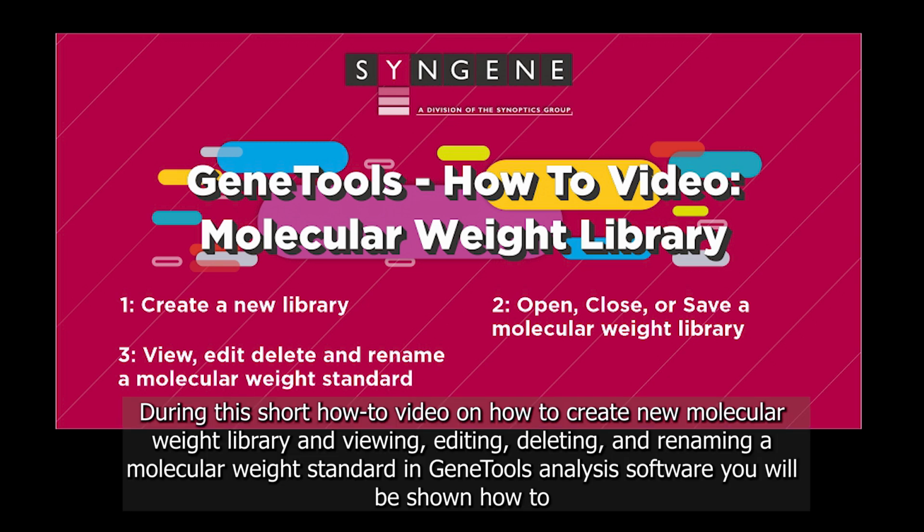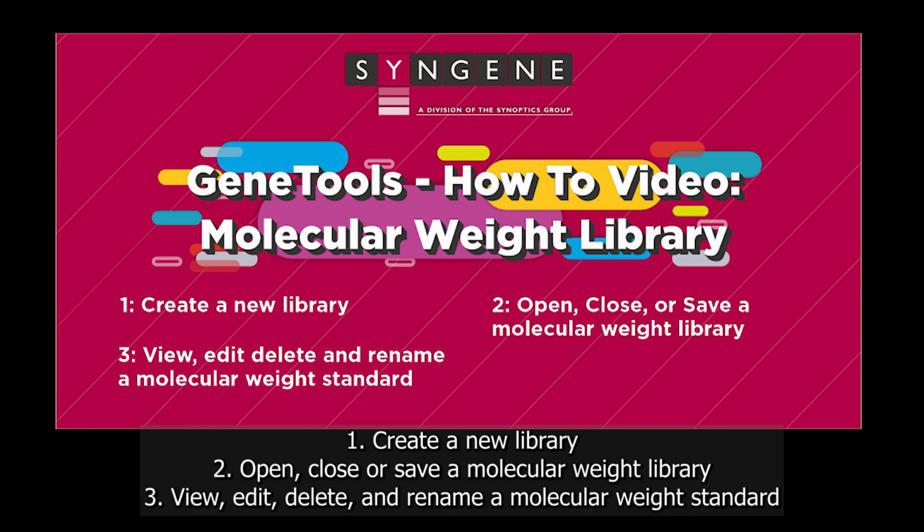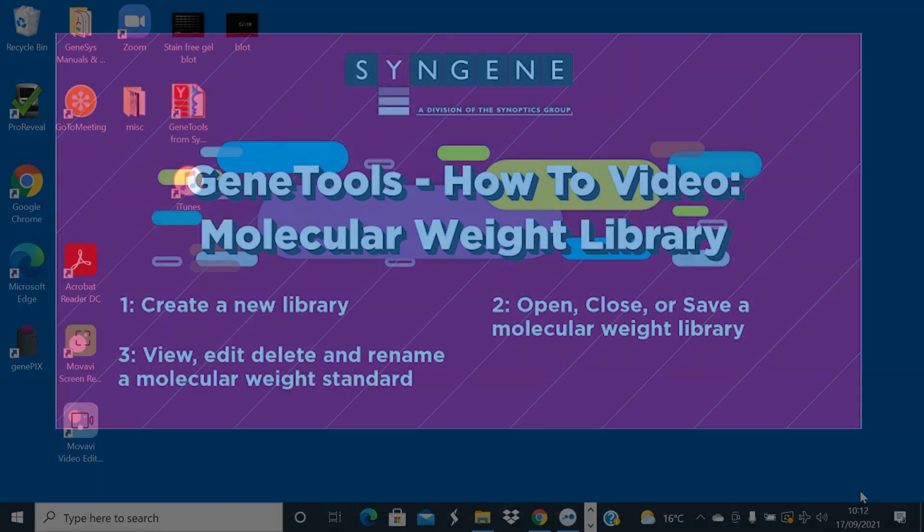During this short how-to video on how to create a new molecular weight library, and viewing, editing, deleting and renaming molecular weight standards in GeneTools analysis software, you will be shown how to: 1. Create a new library, 2. Open, close or save a molecular weight library, 3. View, edit, delete and rename a molecular weight standard.